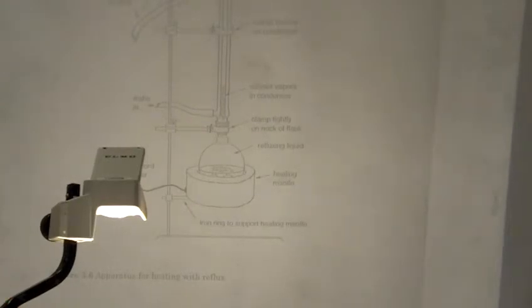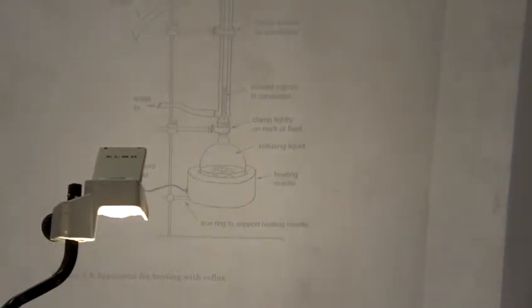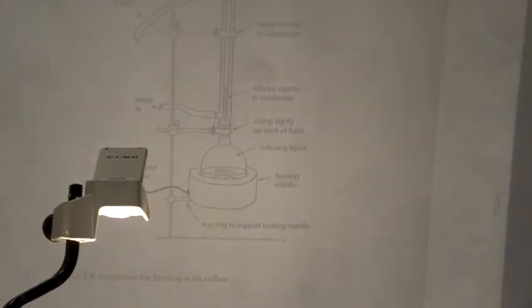You do not start your reflux time until you actually start refluxing, okay? So when you start seeing boiling and condensing, that is when the reflux time is started, okay? And you have to do this for 45 minutes this week, okay? So don't start counting your time when you plug everything in. That's not when it's refluxing. It's refluxing when it's actually boiling and condensing, and your 45 minutes starts then, okay?